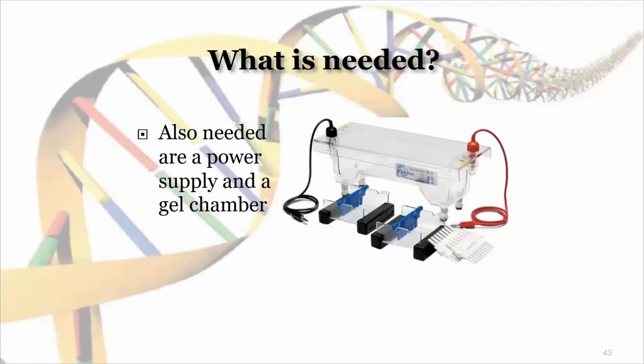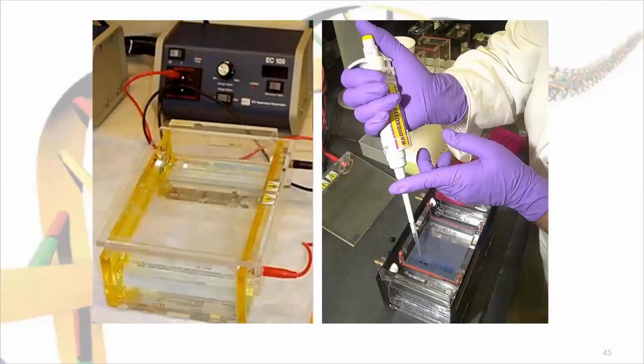So this is the actual electrophoresis apparatus, right? This is another picture where the process is being carried out. This is a power supply setup.